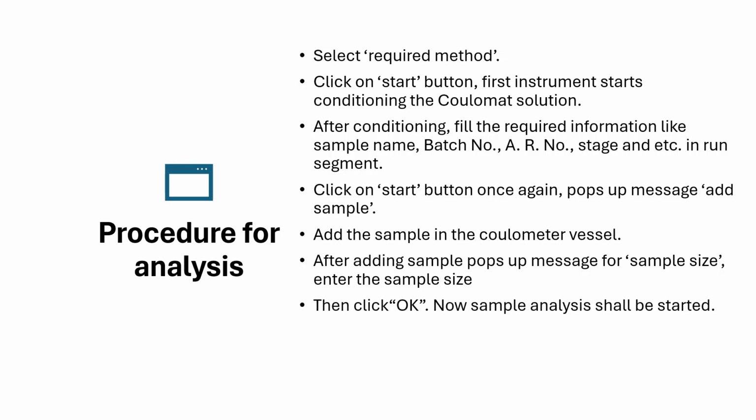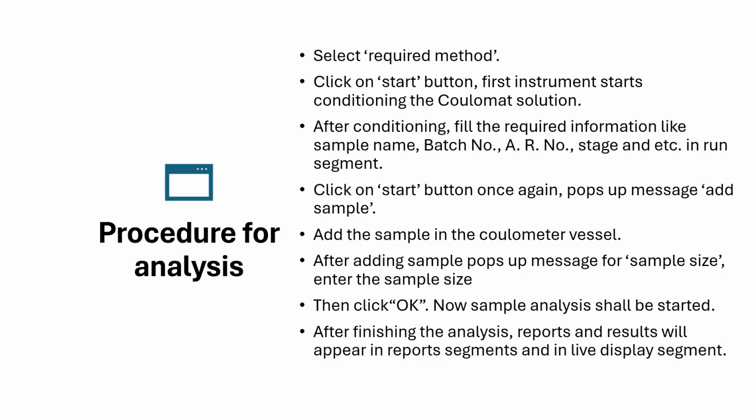Then click on the OK option. Now the sample analysis will start automatically. After finishing the analysis, the report and results will appear in the report segment and in the live display segment as well.